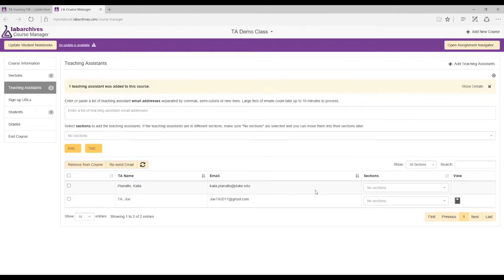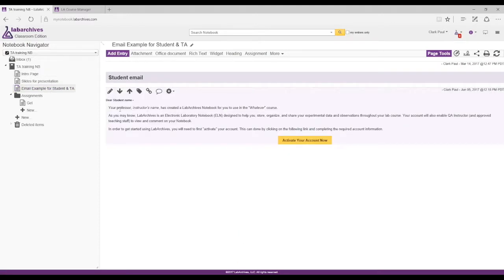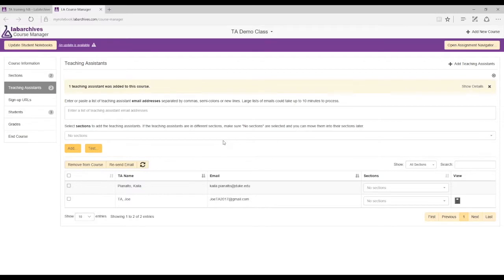You just received an email from Lab Archives that looks something like this: 'Hello, your instructor has created a notebook for you' — something like TA Training. You'll see an activation link in there. Go to your Duke email, find that message, click the activation button, and effectively join my Lab Archives course. The same process happens when the instructor adds students — they get an email and go through the same steps.